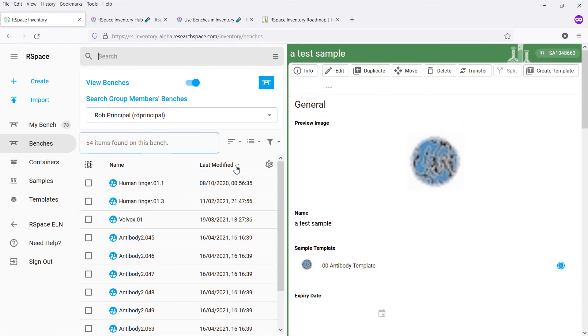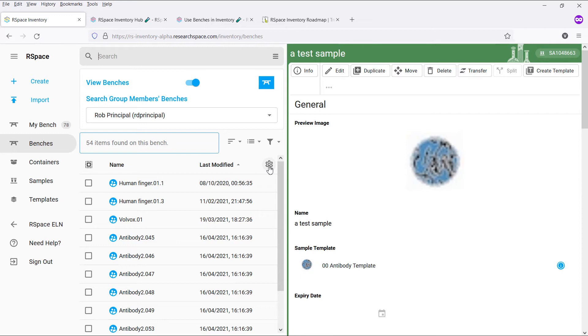The second column will automatically show the property you've selected to sort by. We have also made the second column of the list view customizable.